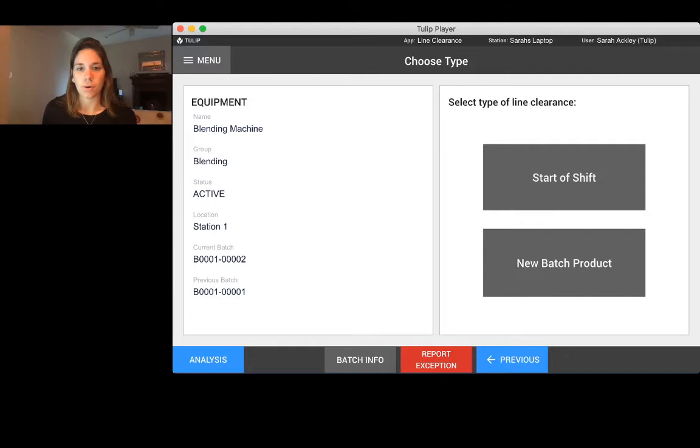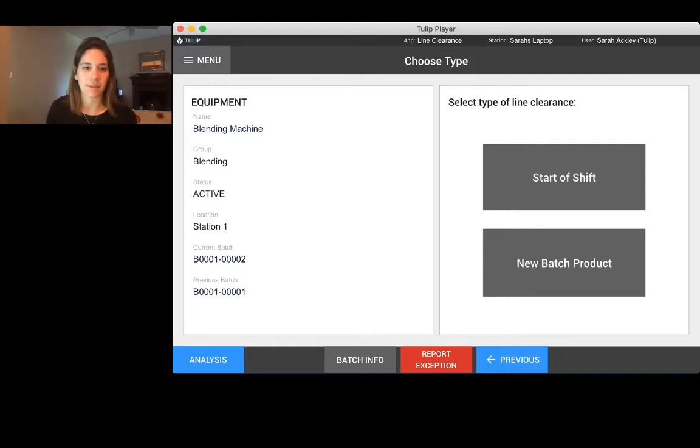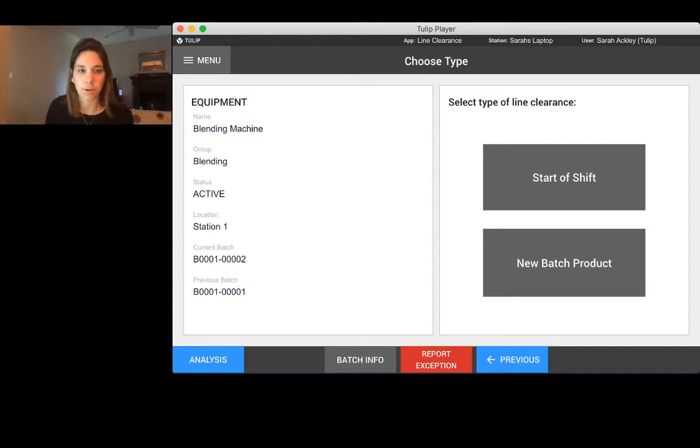That's really great because it's human readable. You can always see what that was and the full audit trail actually exists within TULIP. I'll show you that in a minute.